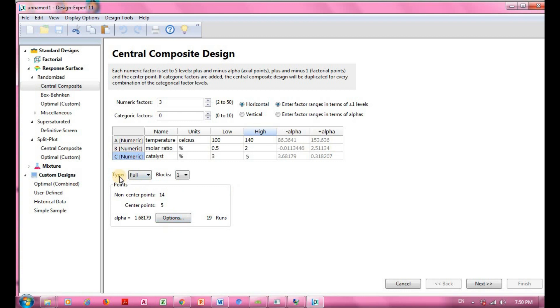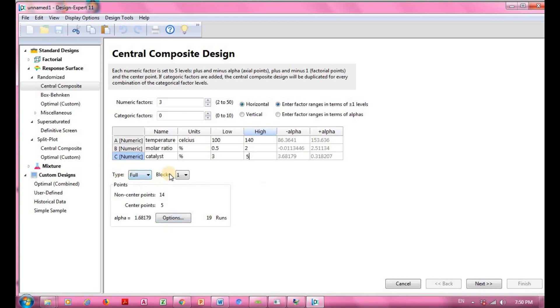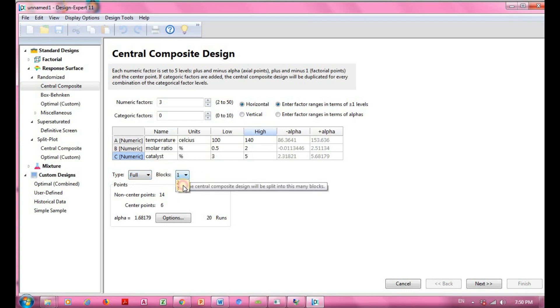I now have a total of 19 sets of experiments to be conducted. For the type, I'm using full factorial with a block of one, which means no blocking.